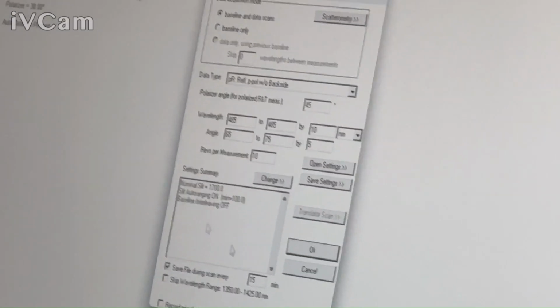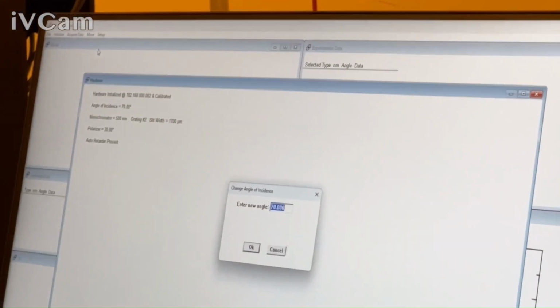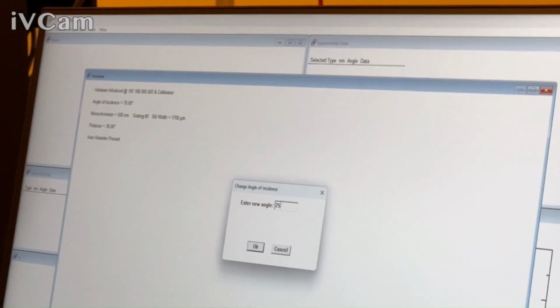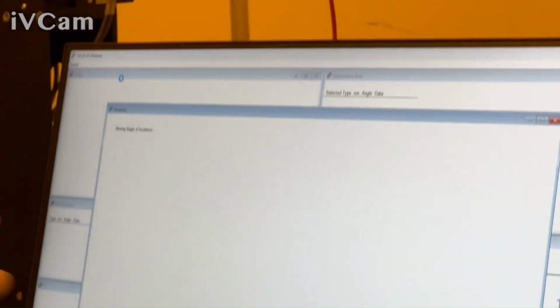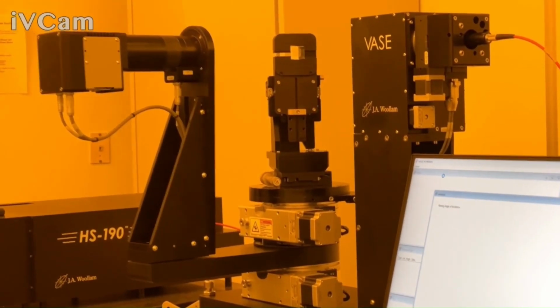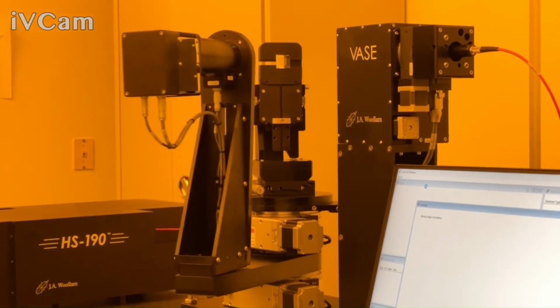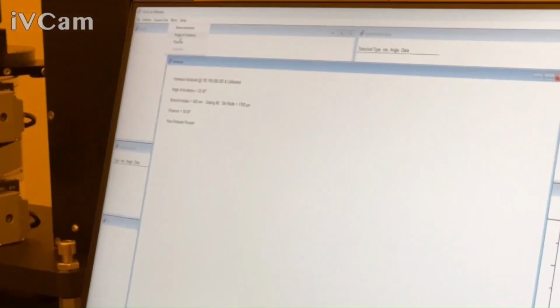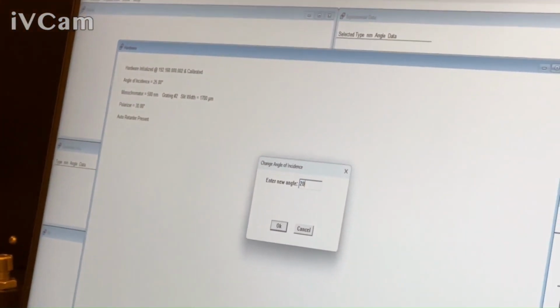Before I do that, let's experiment a little bit. I know that this move angle, we can go down to, let's say if we go down to 25, I just want to make sure nothing's in the way. Just want to see how low we can go. That's 25. Will it let you just smack into it?